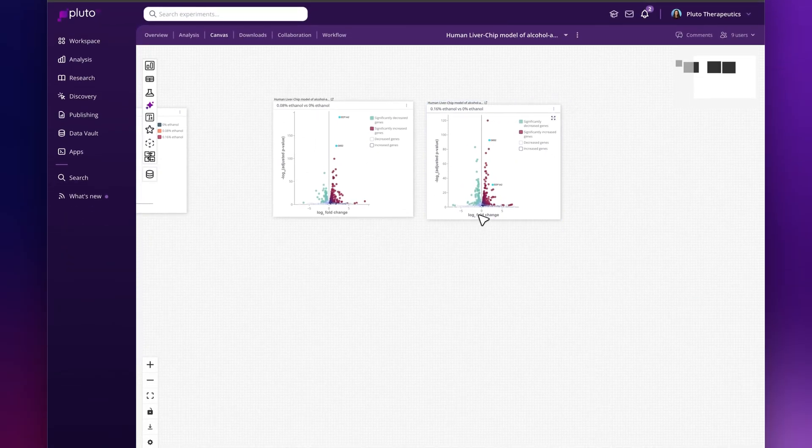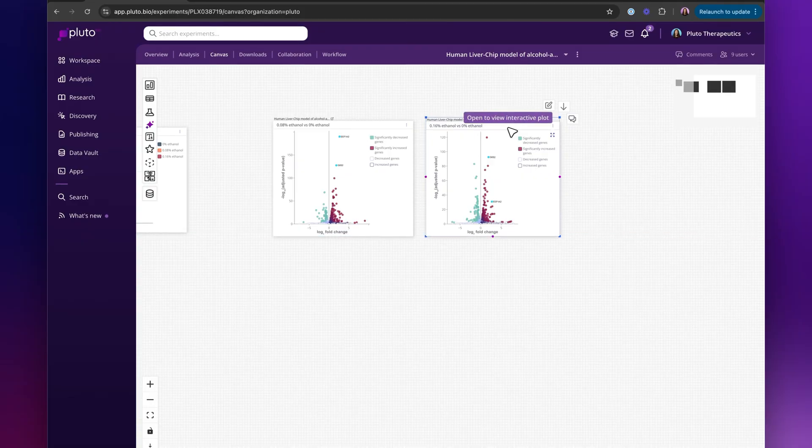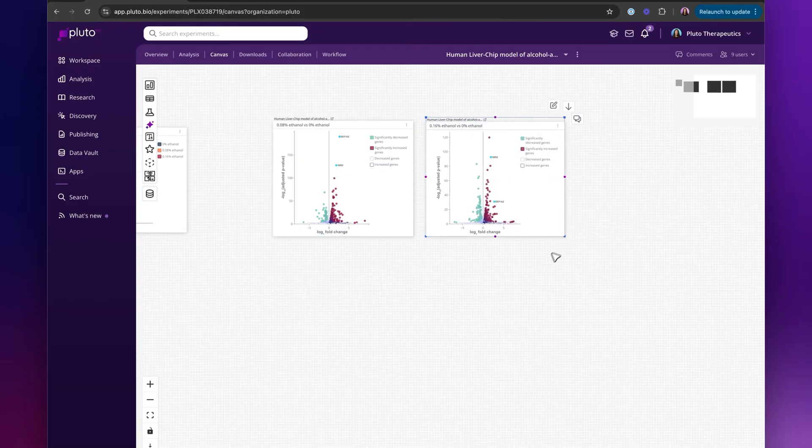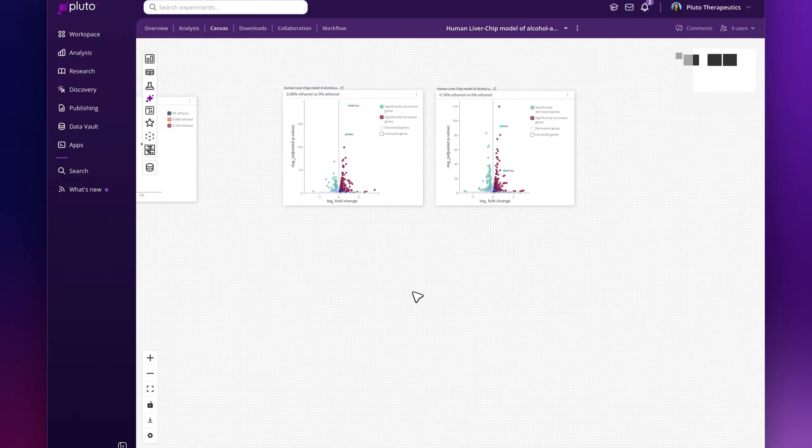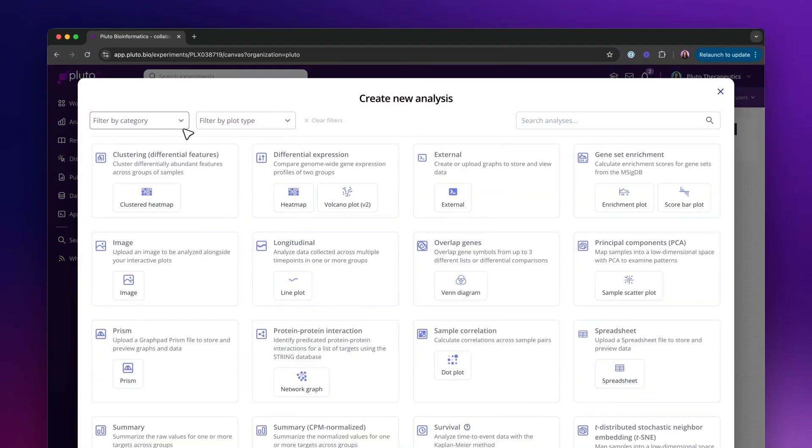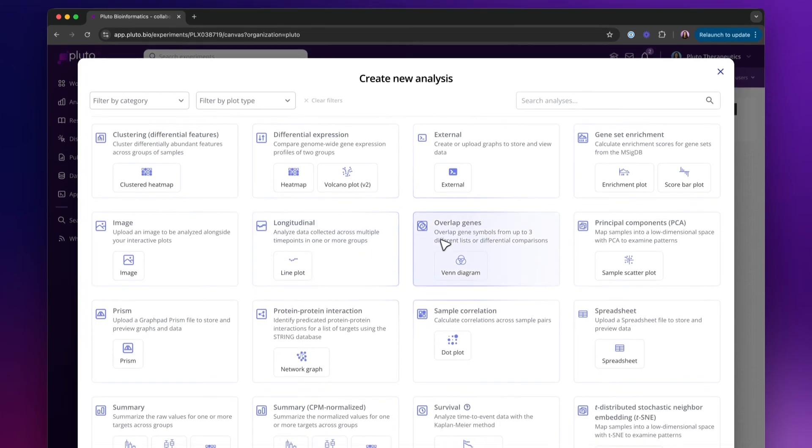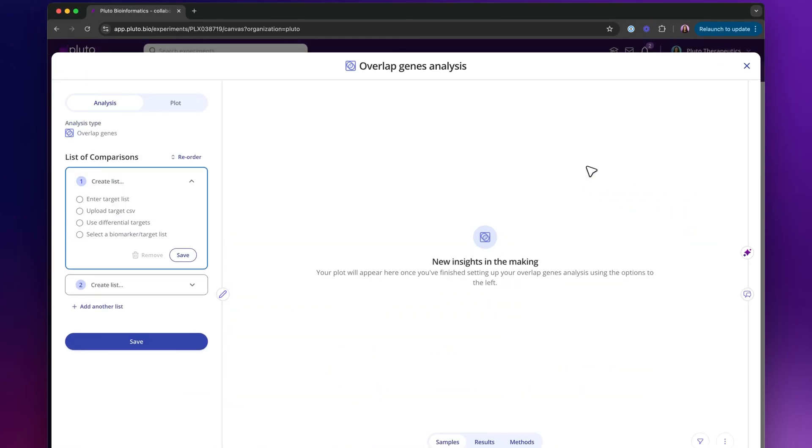Now that I have two comparisons shown here on my canvas, I'm going to do a common thing that I might want to do: overlap the genes between these two differential expression comparisons. To do that, I can use our overlap analysis to overlap genes in these different DEG comparisons.